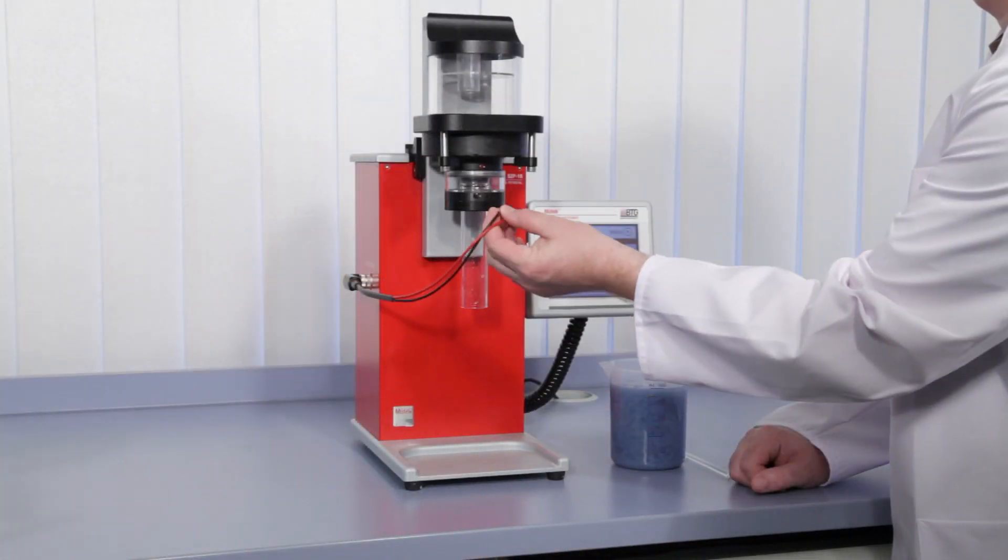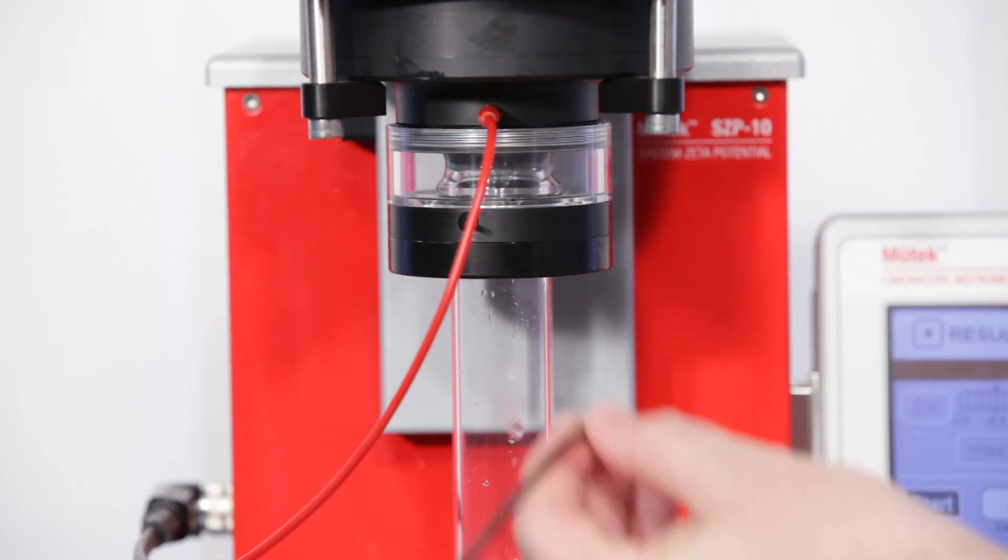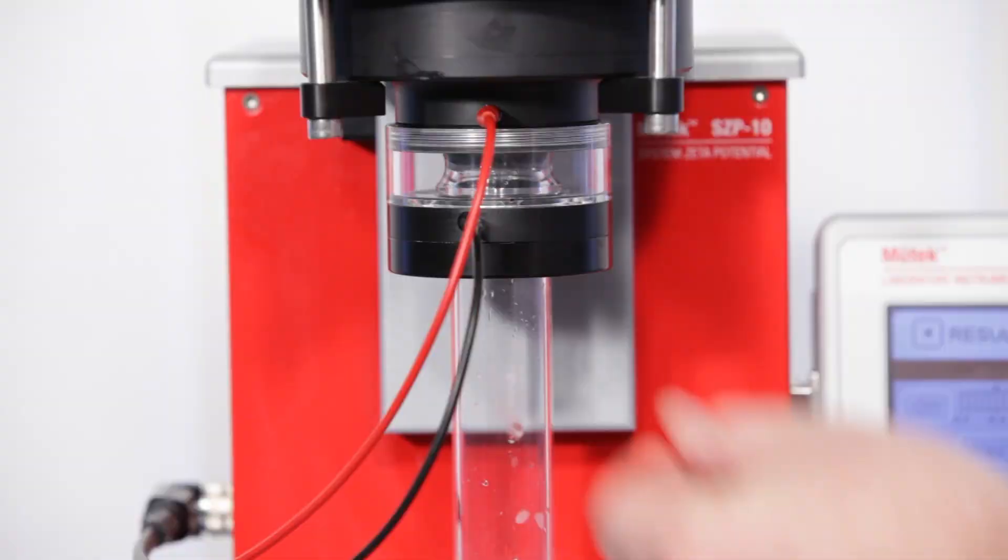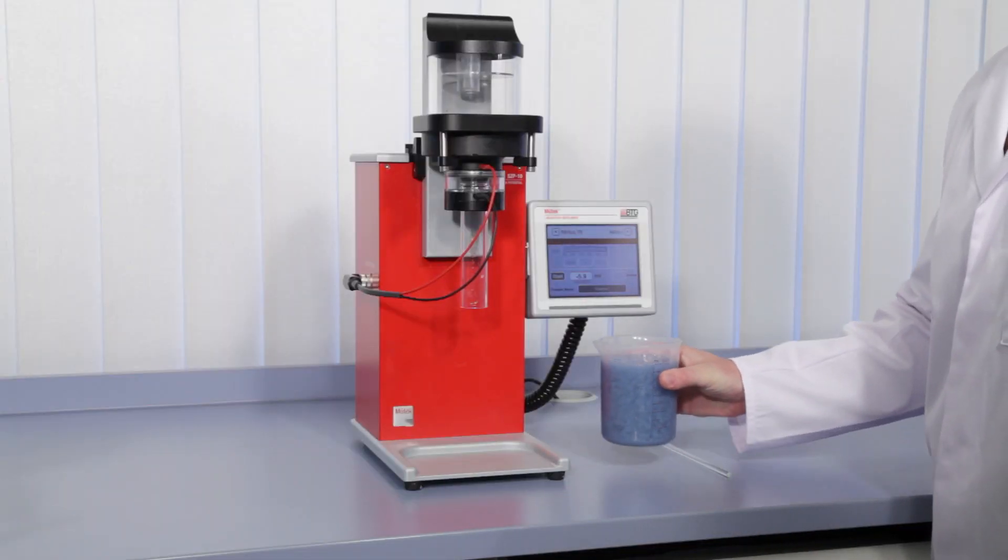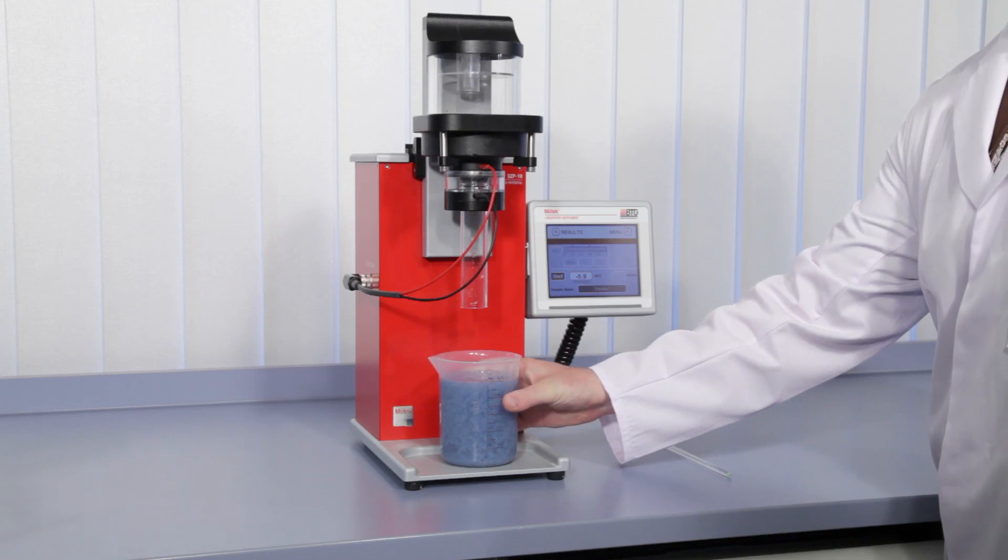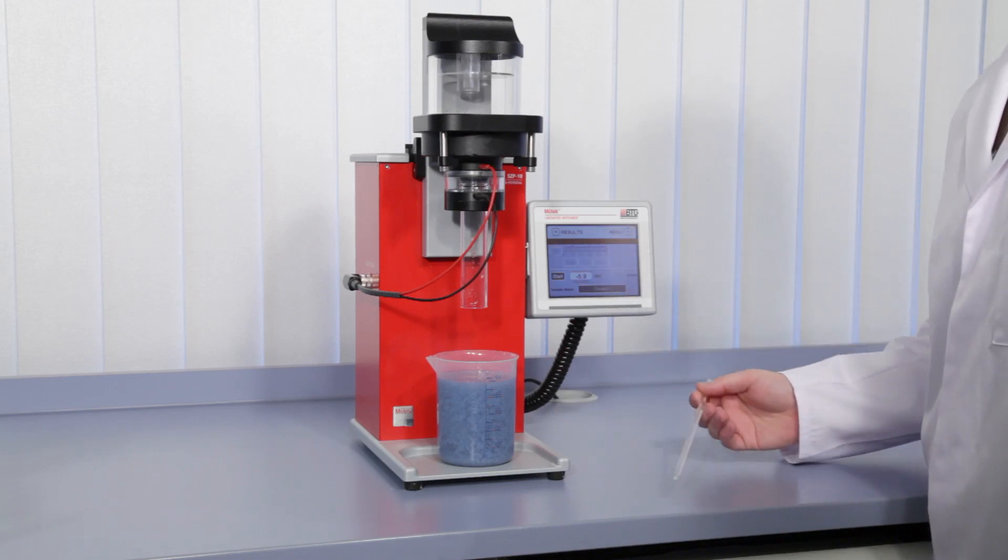Connect the electrode cable to the electrodes, red to red and black to black. Similar to the conductivity measurement before, place the beaker with a 500 milliliter sample on the SZP platform. Make sure that the sample is properly homogenized.